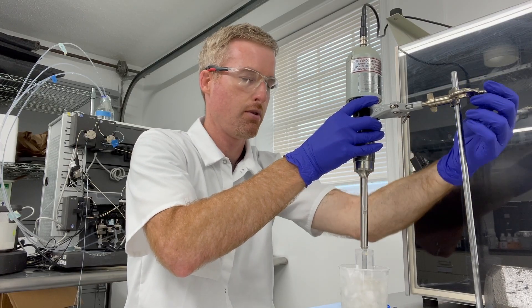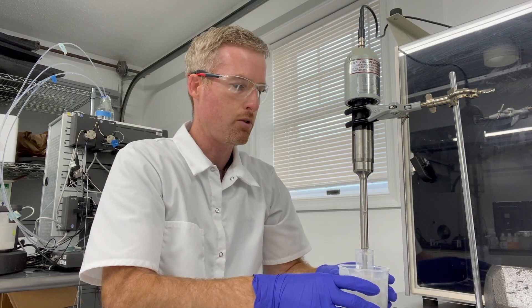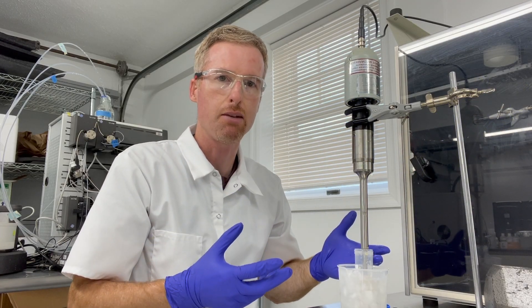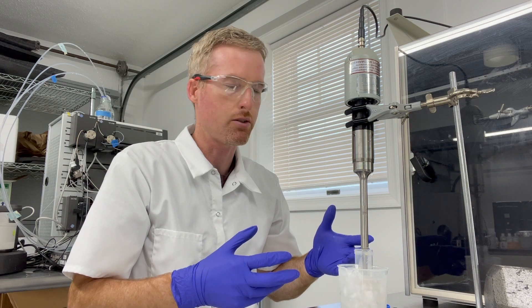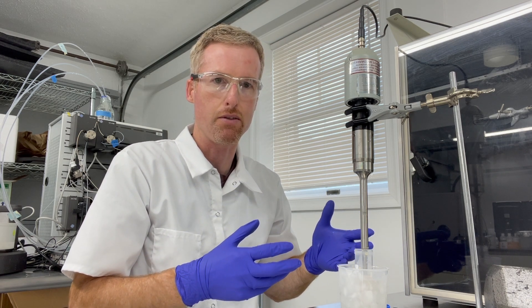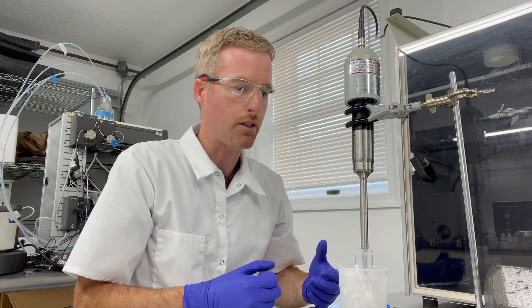That way the tip is about an inch off the bottom of the tube. You want it to be near the middle of your sample so that it's not splashing sample at the top and it's also not buzzing against the bottom of the tube. That way things will mix well while you're sonicating.